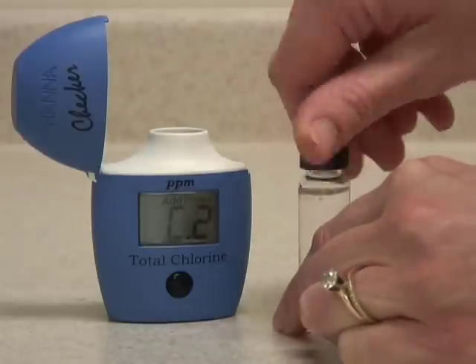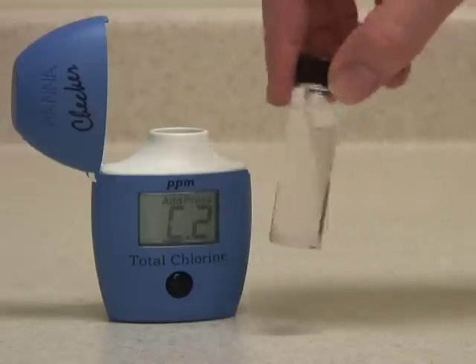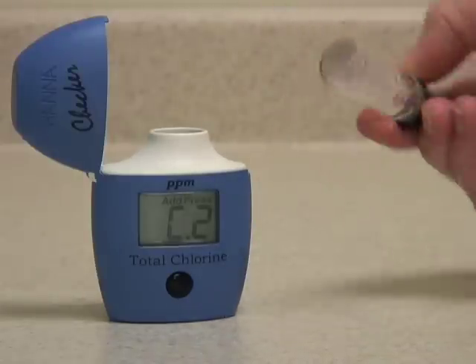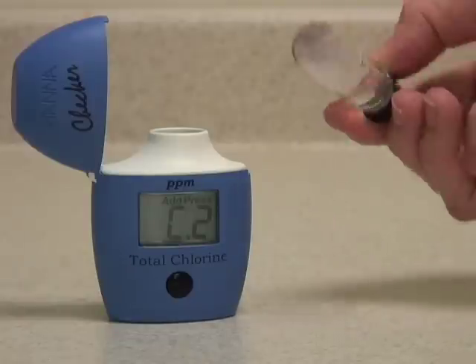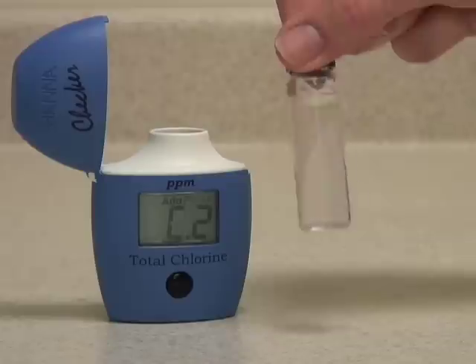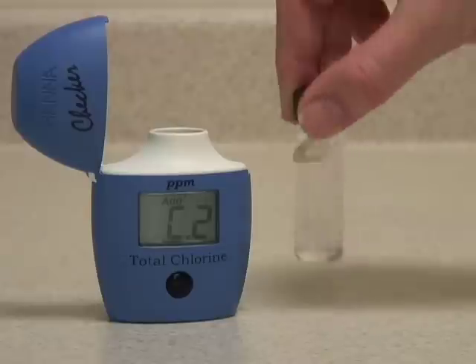Replace the cap and mix the sample. This is best done by gently swirling and inverting the sample. Try to avoid shaking it too much to avoid introducing microbubbles. You can see the sample turns pink as the reagent reacts with the chlorine in the water.